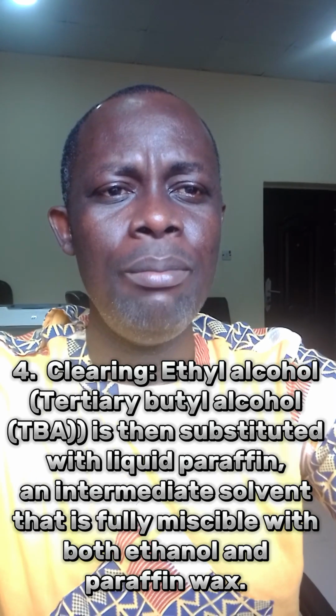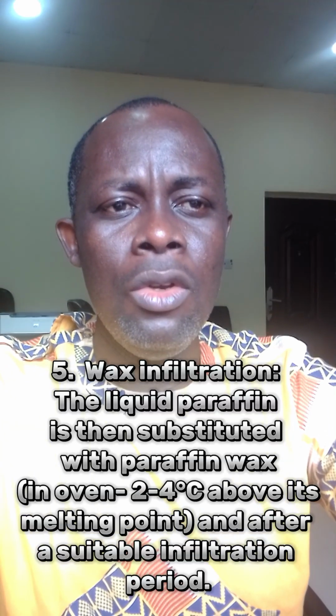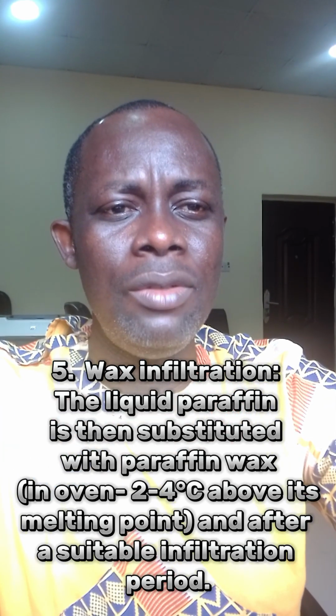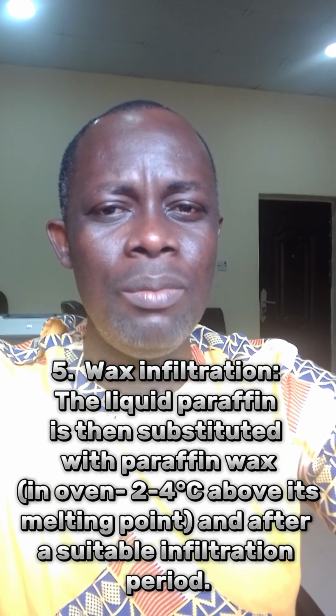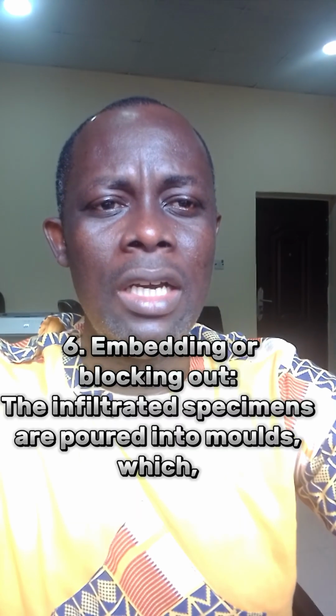The fifth step is wax infiltration. The liquid paraffin is then substituted with paraffin wax in this stage, and after a suitable infiltration period, you go into the next step, which is embedding or blocking out.